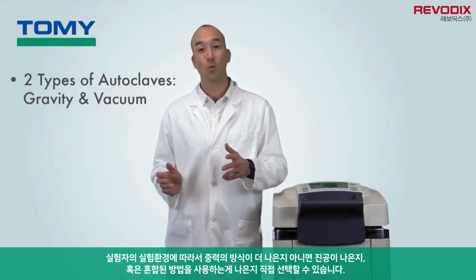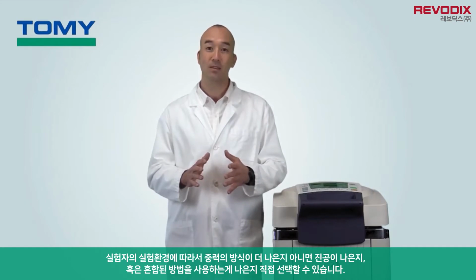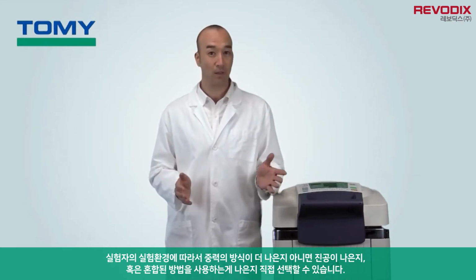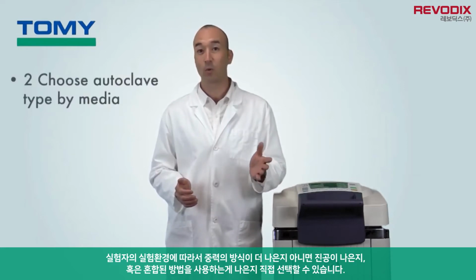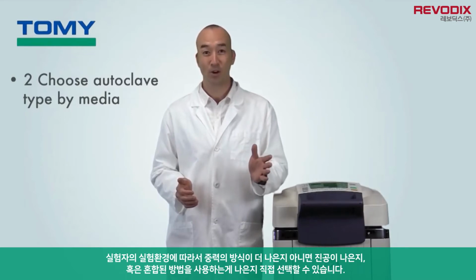Most autoclaves fall into one or the other category, though some use a combination of these different sterilization methods to sterilize. By understanding the difference between gravity and vacuum autoclaves, you can understand which types of media require which type and make a decision on the autoclave sterilizer that's right for you and your operation.